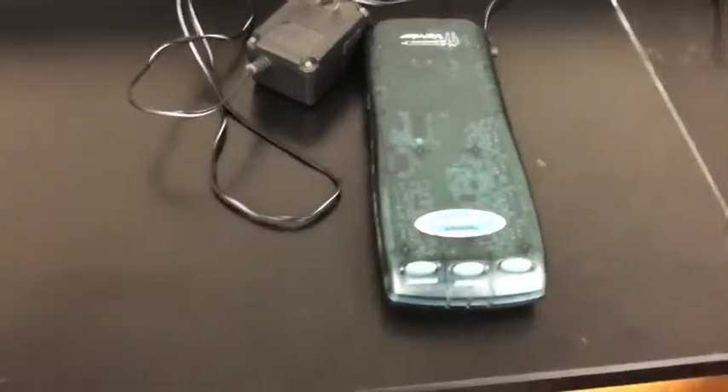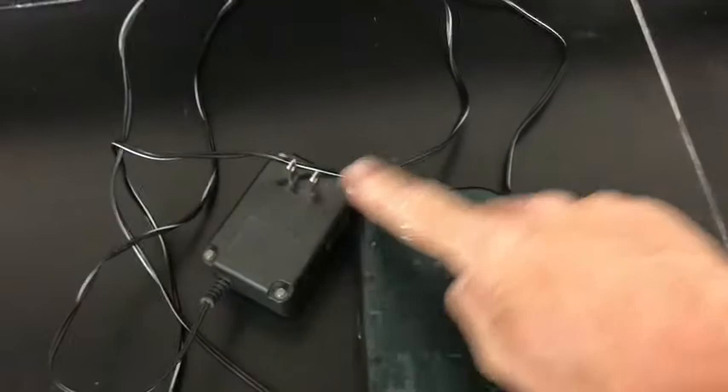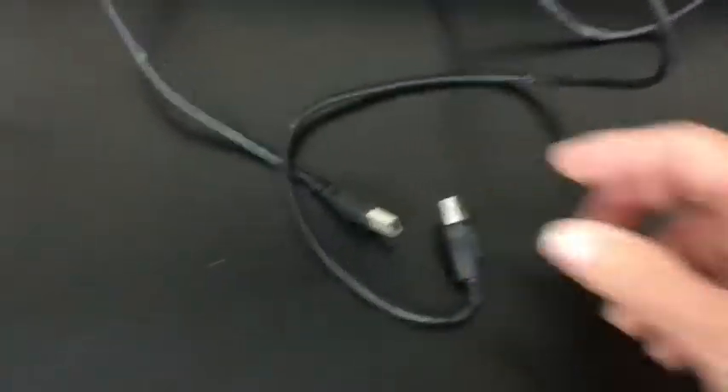Today we're going to learn how to set up one of the LabPro veneer setups. First of all, you are going to need a computer, and you're going to need a green box with its cord, and you're going to need one of these connector cords — which is a component cord — the normal USB on one end and a square-looking connector on the other.